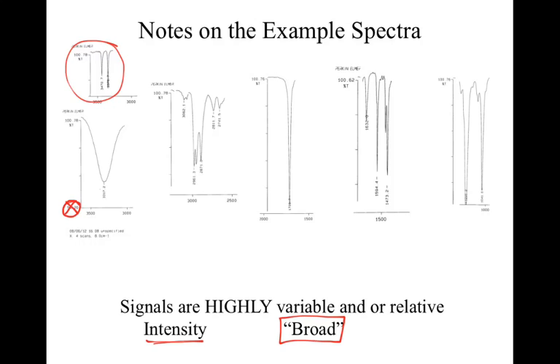Unfortunately, both the NH signal and the OH have some interesting properties behind them. They have the ability to hydrogen bond. If we have a hydrogen bonding interaction, the signal gets broader. If there is very little hydrogen bonding, the signal gets sharper. So in the case of the one I provided for you, that NH shows very sharp peaks. Well, that's because it just so happens in the compound that I had used, we didn't get any hydrogen bonding, or we got very minimal hydrogen bonding.